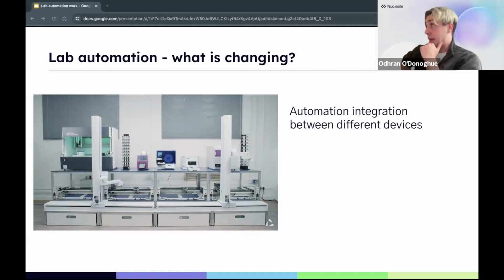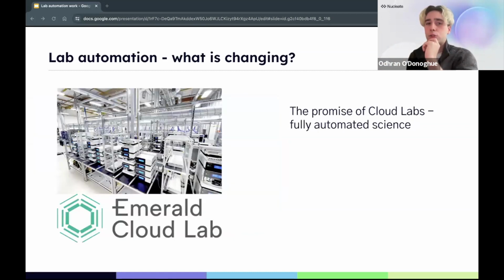The main thing to note here, of course, is that this isn't everything in a lab. You'll notice there's no fridge. You'll notice there isn't a centrifuge really connected. There are other key bits of lab equipment which aren't necessarily integrated with this sort of stack yet. And on top of that, these are often built for custom jobs, like a specific function in a lab. So while we're getting there in this capacity, it's not everything. However, people are trying to push the envelope and are trying to automate as much as they can, and making this available then to as many people as possible.